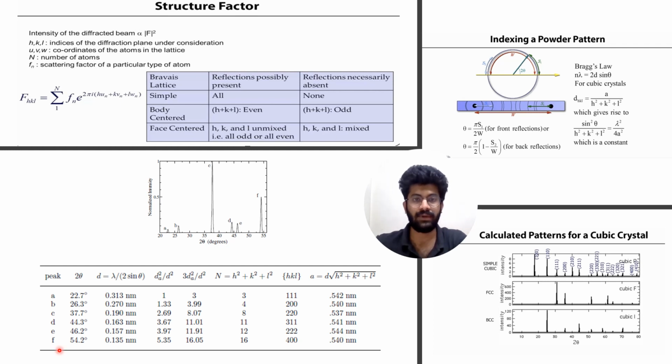The pattern we get on the detectors is the data in reciprocal space, where the points correspond to the square of the structure factor. Here we have taken an example where the peaks are visible and the table corresponds to the processing that we are doing to get something meaningful, the lattice parameters. Limiting myself to this much only, since the complete description would take too long.